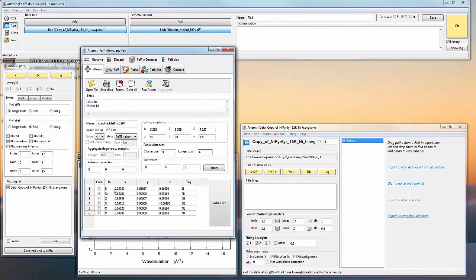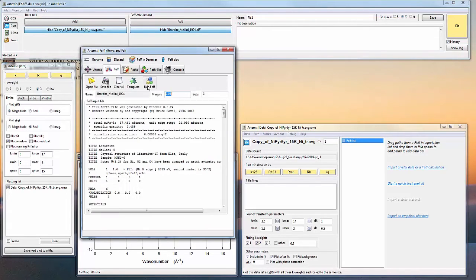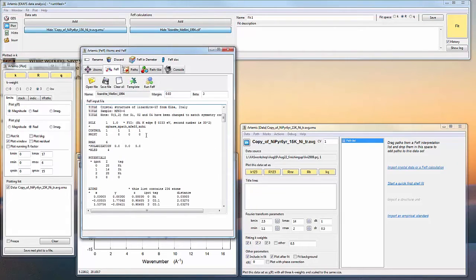And silicon is also present in the tetrahedral sheet of this silicate mineral, so we're going to leave that there, because the layered double hydroxides over time can silicate and also have silicon in there adjacent to the octahedral layer. So now I can run Atoms.